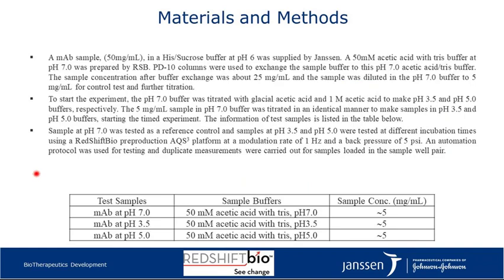To go over the experiment shown here is a lot of text. It outlines exactly how we prepared the experiment. In brief, MAB was buffer exchanged using the GE Healthcare PD10 columns to obtain exact buffer match between the background and the sample itself. We did some work before showing that this is a great way to generate the background match to the sample.